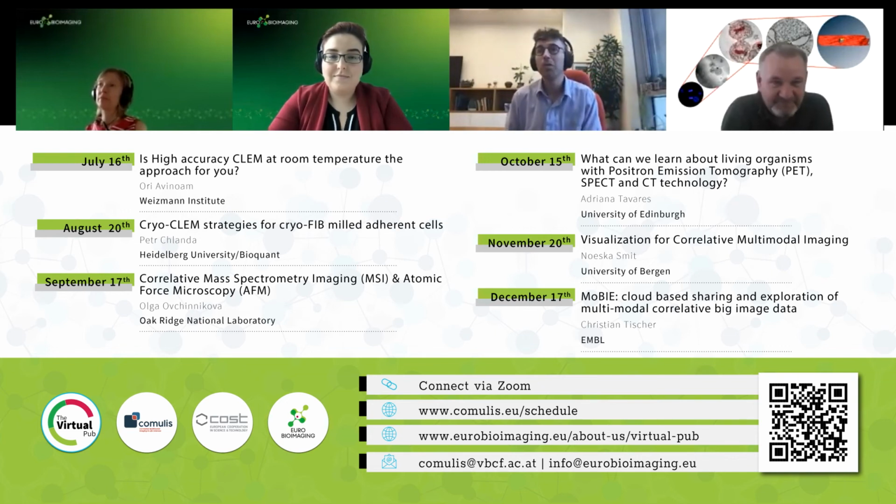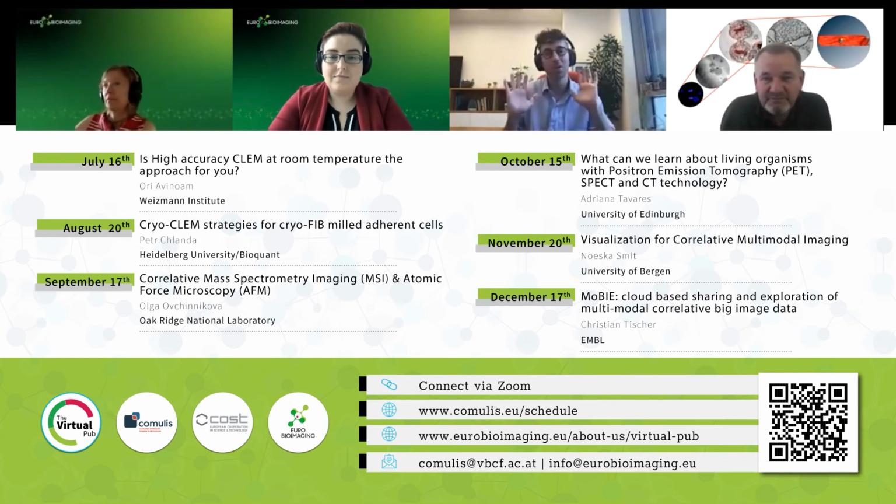So if you were to do that, you need a process that takes longer than that, where you can be confident. Now, if your sample is fixed already, then indeed you can use stochastic super resolution techniques where you need to image over long periods of time because your object is not moving. What that might do to the preservation of your sample later on, that's a question for the experts.